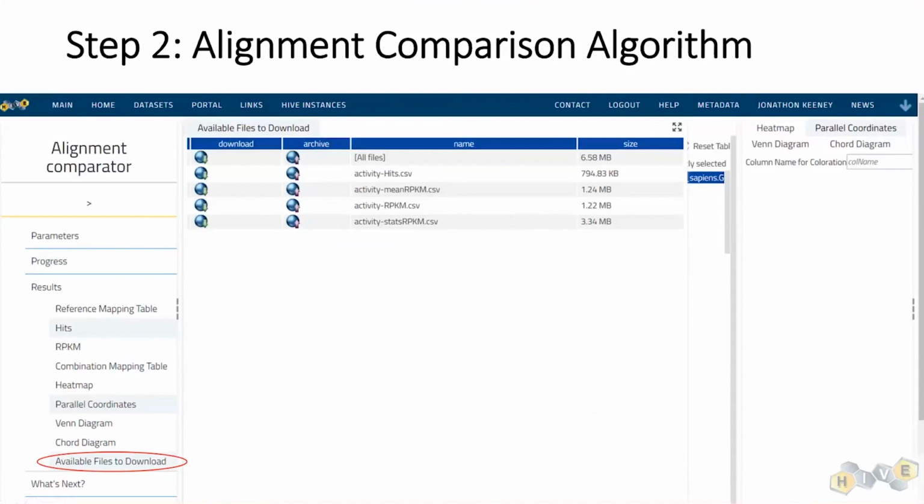That pulls it out of the computation object in Hive and ingests it as a separate object all by itself so that you can work with it. So that's how you take that data and prepare it for use. Again, the only other thing that you'll need is to tell it which categories you're interested in.